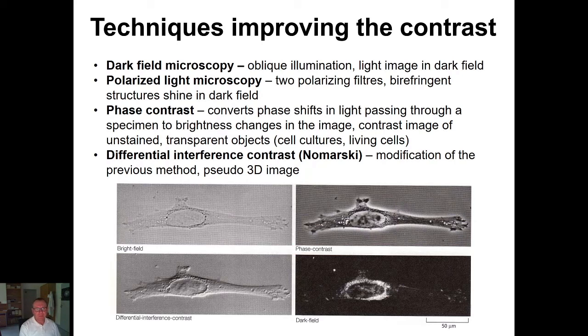And living cells in bright field haven't got a very good contrast, but when we use various improvements of the contrast, phase contrast, which is caused by a special condenser and objective, contrast is better.